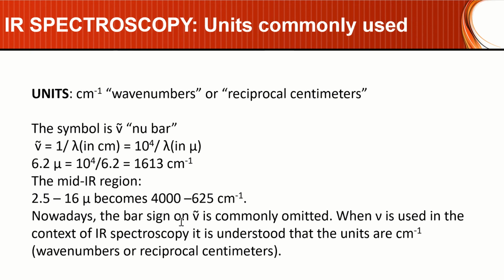Nowadays, the bar sign on our nu bar here is commonly omitted, right? So you might not see the tilde or the dash above the nu.